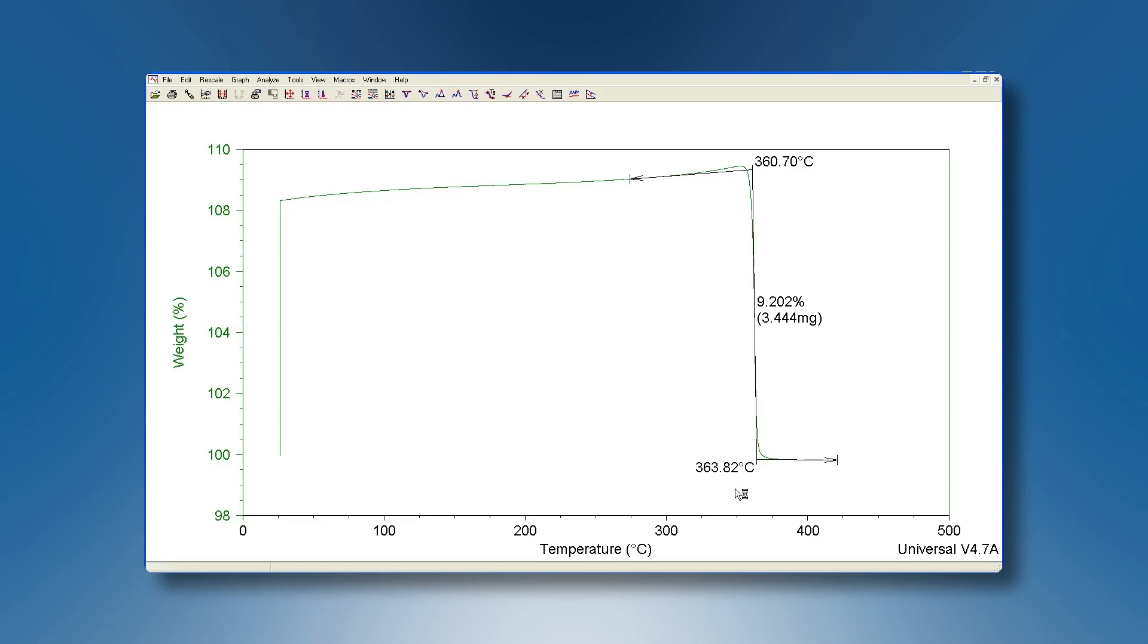Note, if the EGA furnace is used instead of the standard furnace, a weight increase is detected instead of a weight loss. Use the same calculation procedure to determine its extrapolated endset.